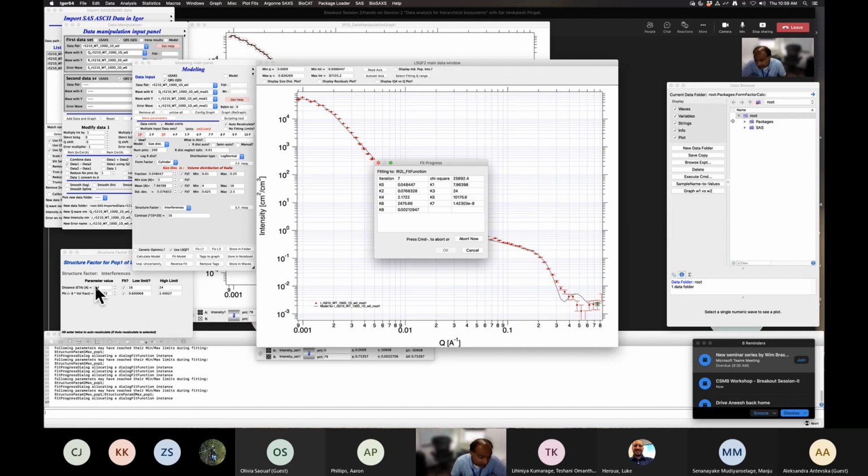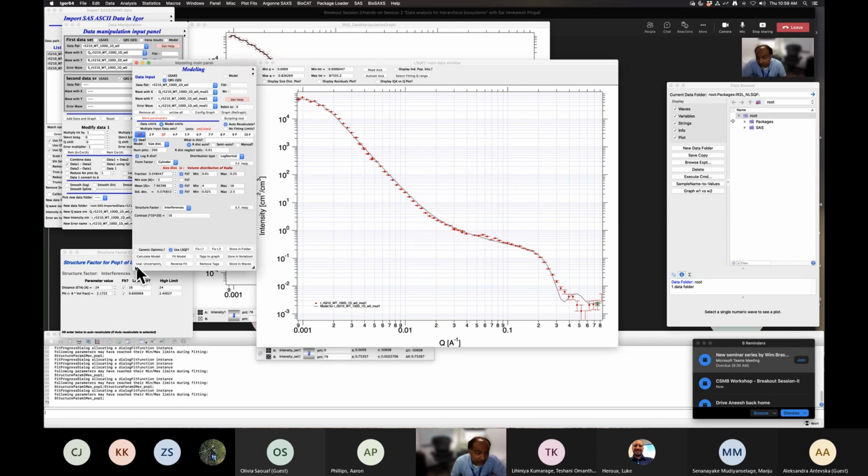No, this has hit its limit here. So this has hit its limit because it's forcing that to go. So I would just say there's some degree of polydispersity, and we cannot determine that, but we can say that there is a rough... What is a rough?